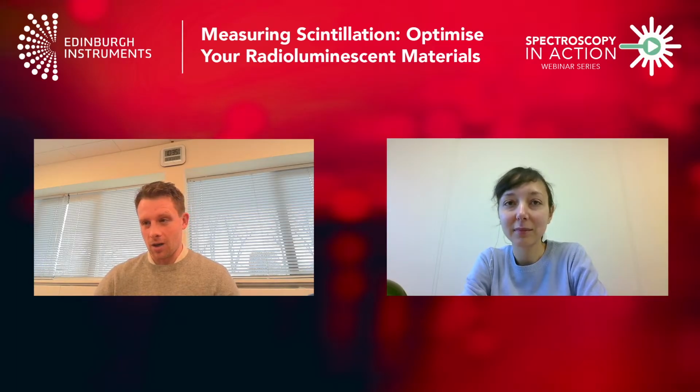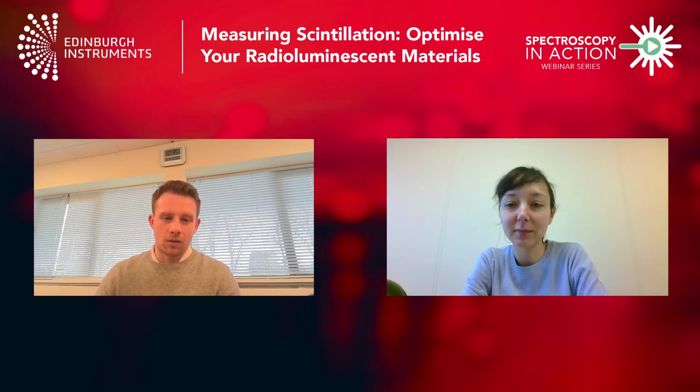Another one: what is the shortest radioluminescence lifetime that you're able to measure? Okay, so that depends mostly on the source and the detector. I've not gone too much into detail about time-resolved luminescence. We have other resources that explain how that works. But if you want short, then you go for TCSPC, and we will use an HPL 450, which is one of our sources, a standard one, which is 100 picoseconds, and that's going to define the minimum lifetime you can measure. If you use a fast detector, then you can go down to tens of picosecond lifetimes. That would be the lowest limit.